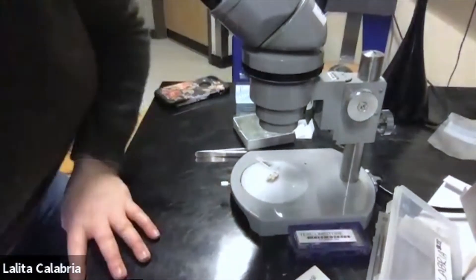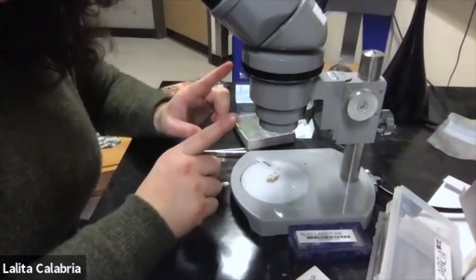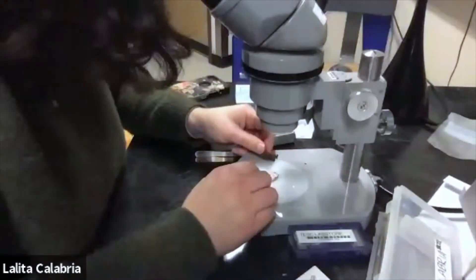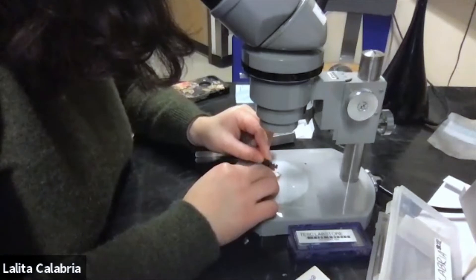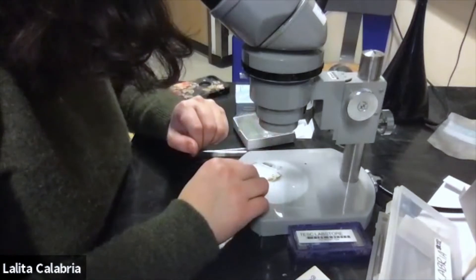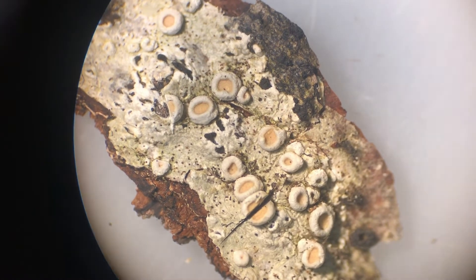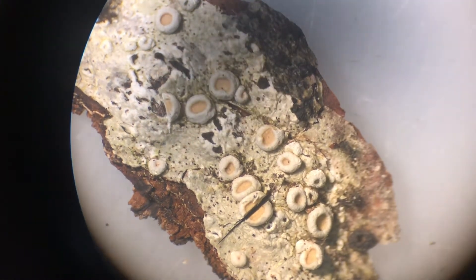It's best to cut through the lens of the dissecting scope, but if you don't have one or have a digital one, just do the same thing without it. I'm going to look through my scope, find the apothecia I'd like to cut, and start by cutting it right down the center. I've made a section right down the center, and now I'm going to take a picture with my phone to include in the video.